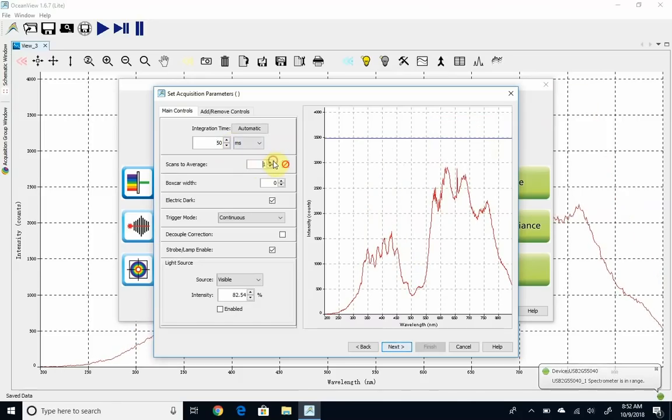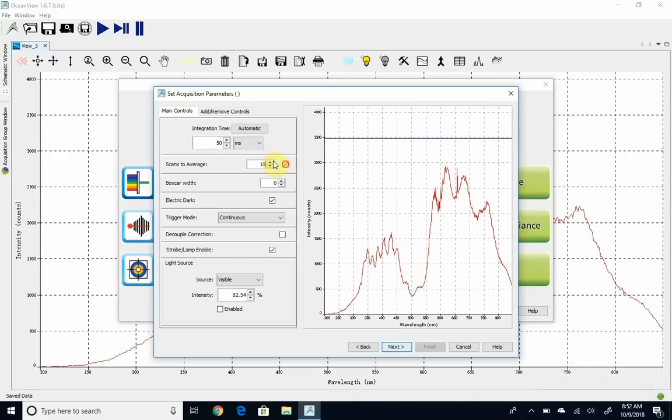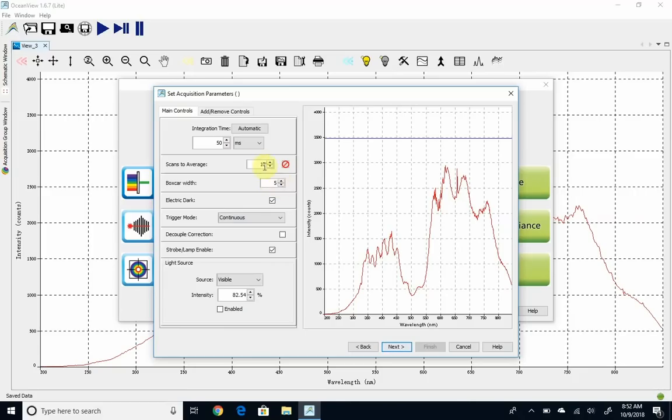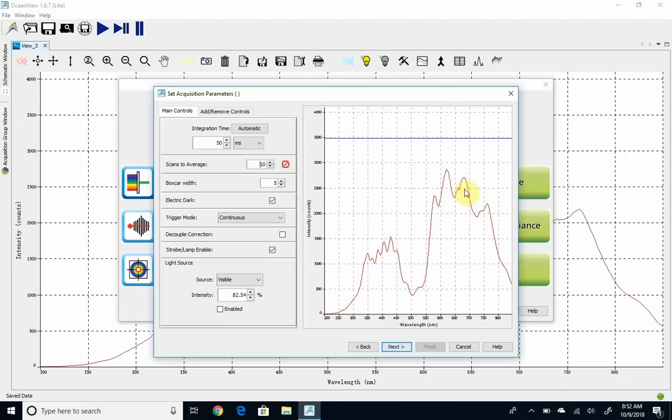You'll notice it's pretty noisy and jittery. I'm going to average some scans, and that's going to help reduce the noise. As soon as I click off that, you'll see it's updating less frequently, but there's a little less jitter. The box car width is a smoothing function. I'm going to use five. We don't need fine resolution on this, and this will give us, again, less noise.